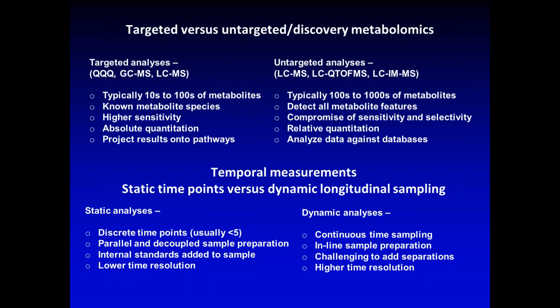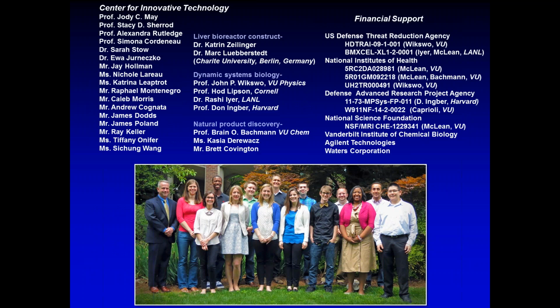And so just to wrap up, I'd like to remind you that temporal analyses are really driven by the aim of the experiment, and whether you're doing targeted or untargeted really directs both the instrumentation and what you hope to achieve. In terms of temporal measurements, it also depends on whether you have the ability to do dynamic analyses almost in real time, or whether you're doing static analyses. But from my perspective, a pinch point in the field is understanding the best way to do biostatistics and bioinformatics. And now with that, I'd like to thank my colleagues that have performed the research, several of our collaborators, and these funding sources for their support.